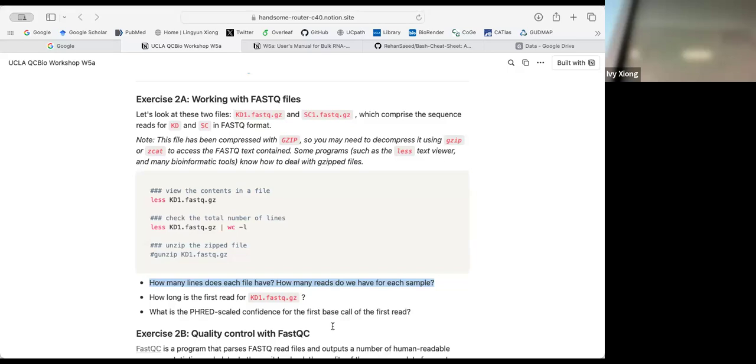So if you want to view it, you either go into the folder first and then use less, or you can try a different one. So let's try less. Sorry, you go up, cd, so you go back to the original folder. You can also say less data. So you can also view it, but if you're not in the folder, you have to specify where the file is. Does it make sense? Yeah, I'm not in the folder, okay, gotcha.